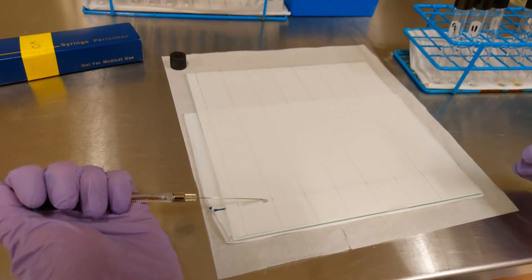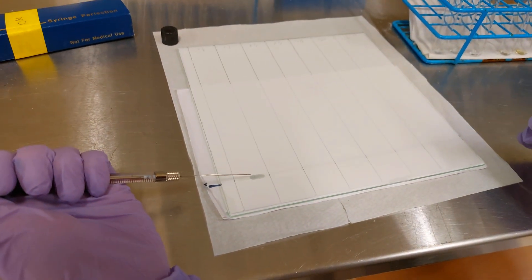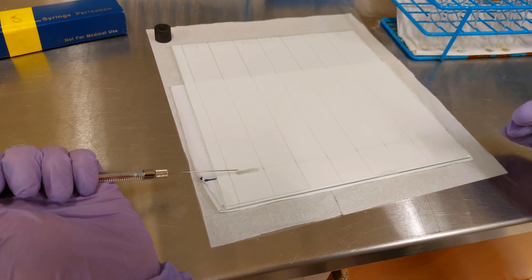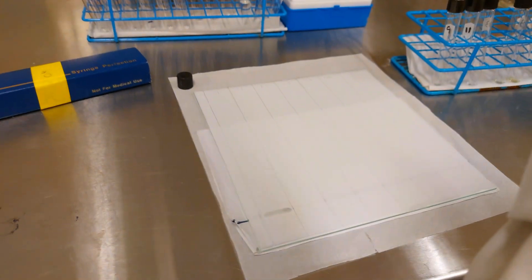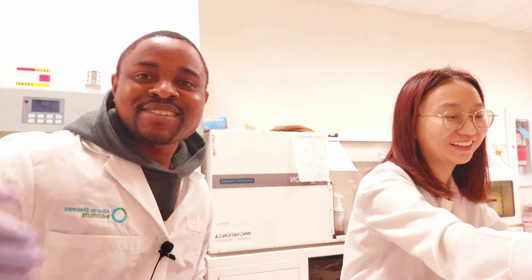The solvent will dry up anyway because it's in chloroform/methanol, but the sample will remain. This TLC plate can take about three samples. As you can see, we have different sample numbers, and we can spot them in duplicates.